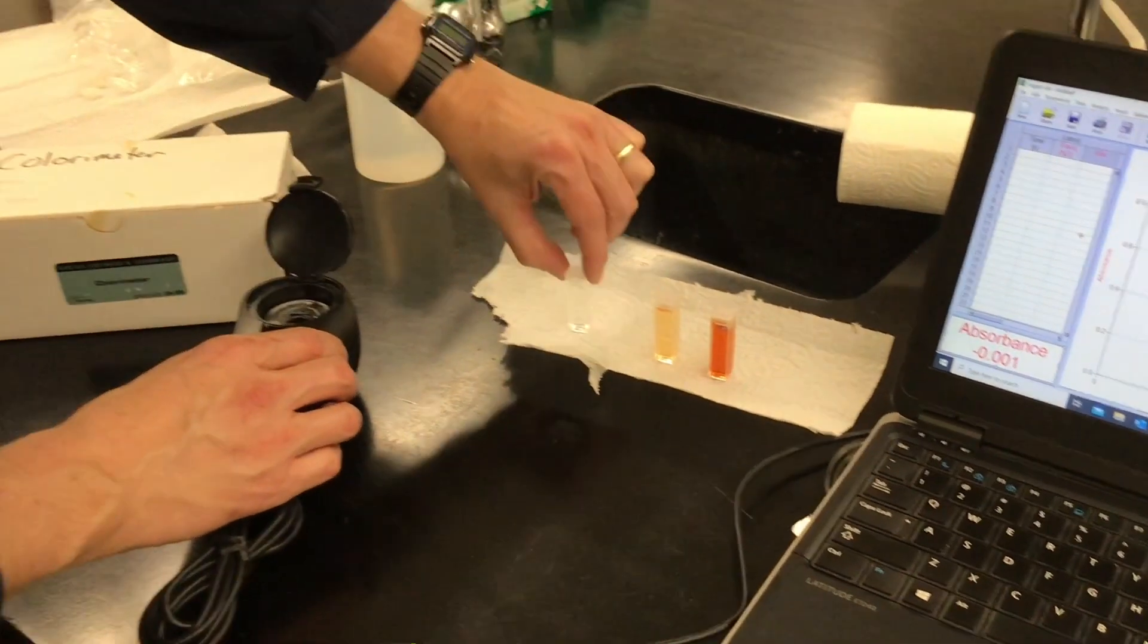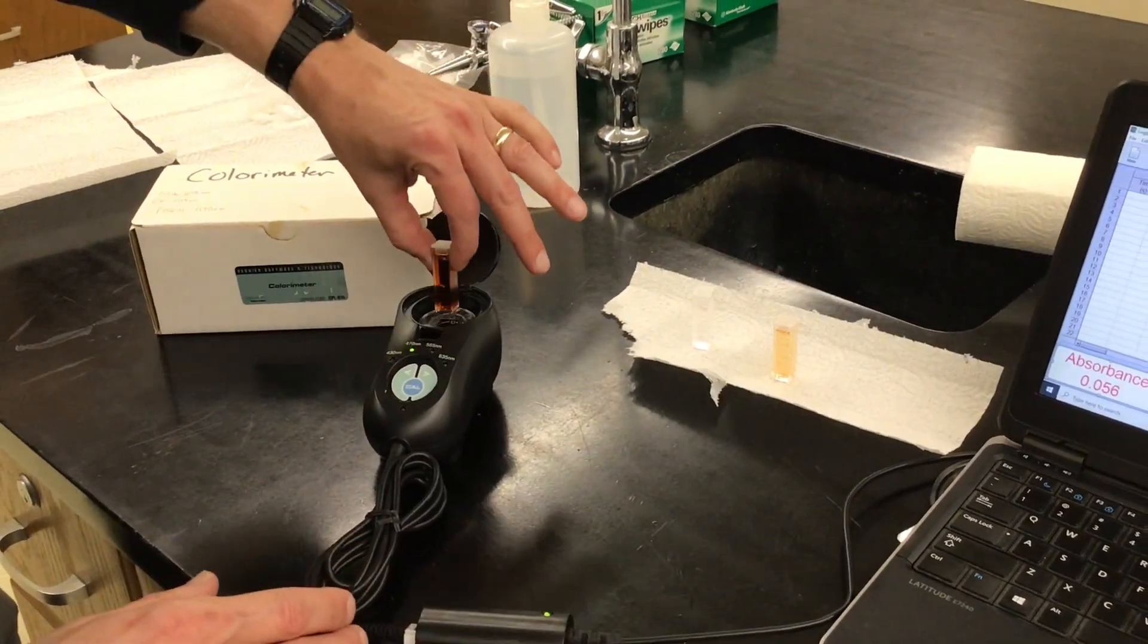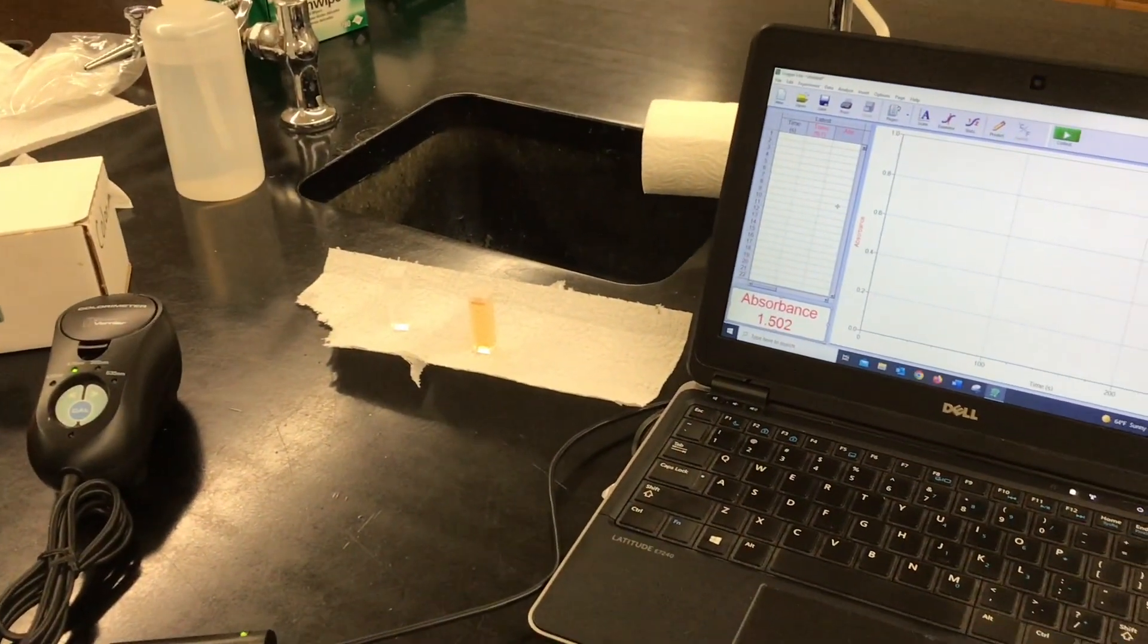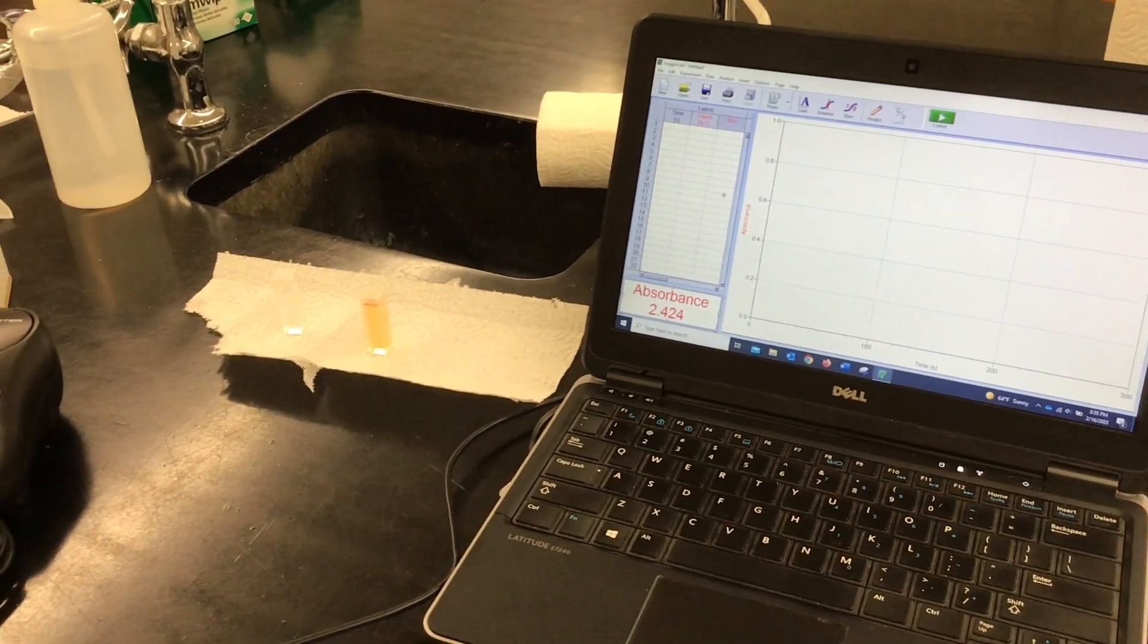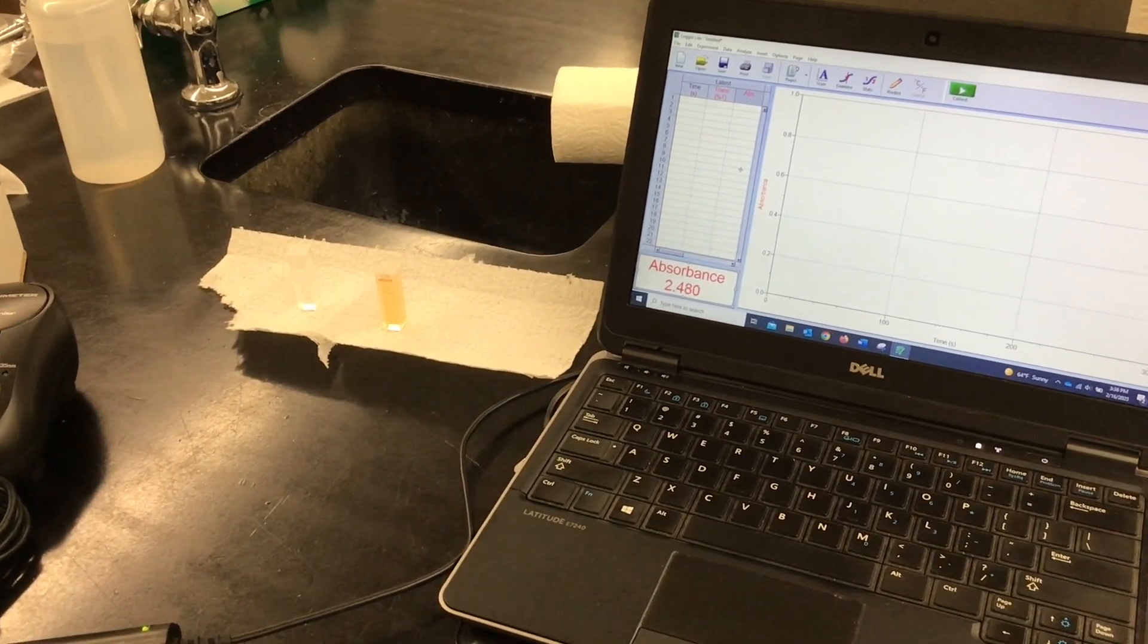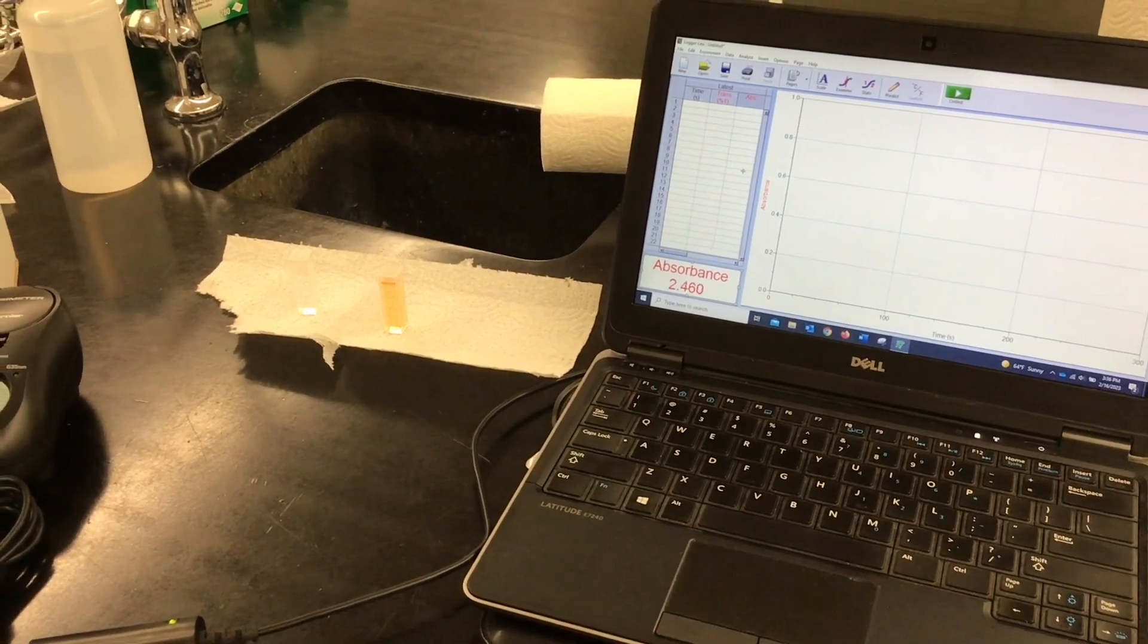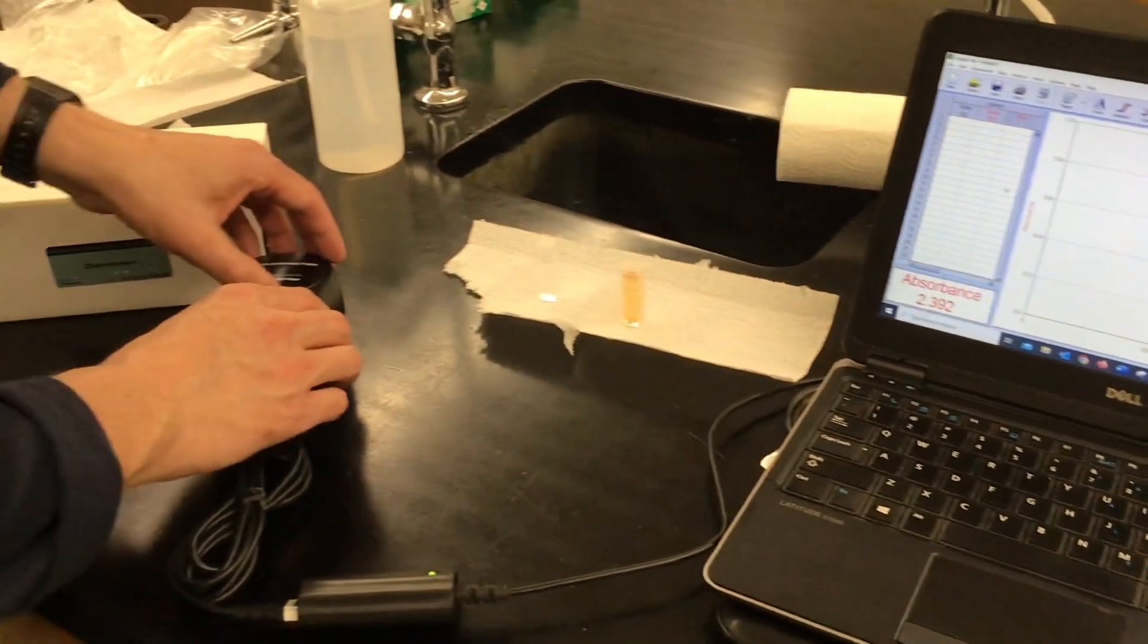So when we make the standard solution, it's going to be really dark because we shift it right really hard on Le Chatelier. So it's going to read about one or two on the absorbance scale, two point something. This is just a practice solution. I didn't make the exact solution. We'll make that solution tomorrow in class. So that absorbance is going to be whatever molarity we calculate and I'll have the data for that later.